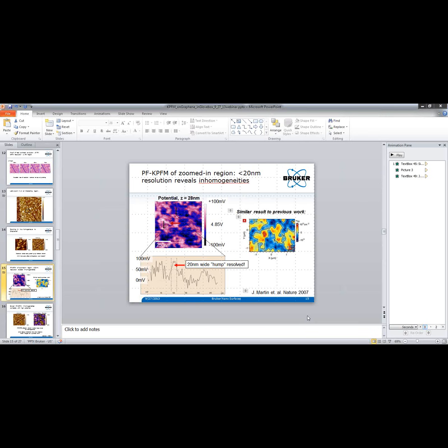You may run into some problems because these samples are usually very small, and you will be close to the electrode. So you may have an issue with the electrode locally influencing the work function that you measure, which I sort of saw a hint of on my huge scan that I did, where I saw graphene being different near the gold electrode, and then having a lower work function farther away.